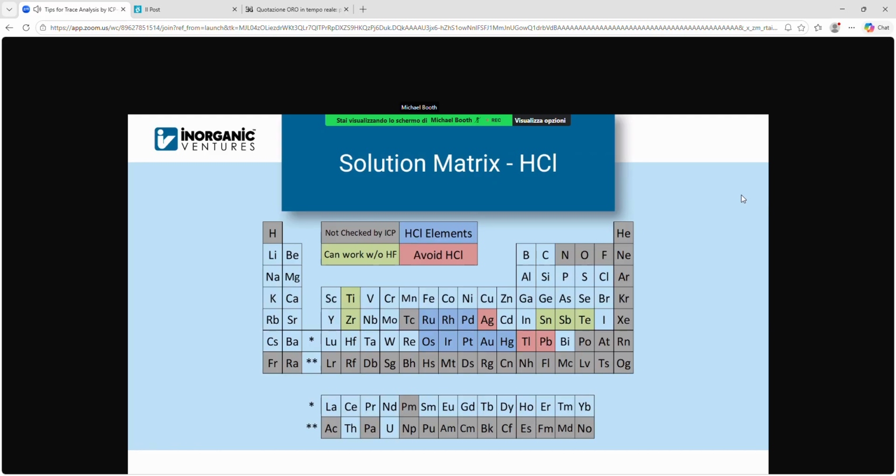But again, you just have to have that chloride in major, major excess. For thallium, it's all about the oxidation state. So thallium plus 3 is going to be good for HCl stability, where thallium plus 1 is going to fall out of solution. And then for lead, it's all about the concentration. So concentrations less than 500 ppm are okay in HCl. Above 500 ppm, you can start to see issues. You might form a precipitate. So the thing about HCl that's really good is there are elements that have issues with it, but again, you can work around all three of those elements.